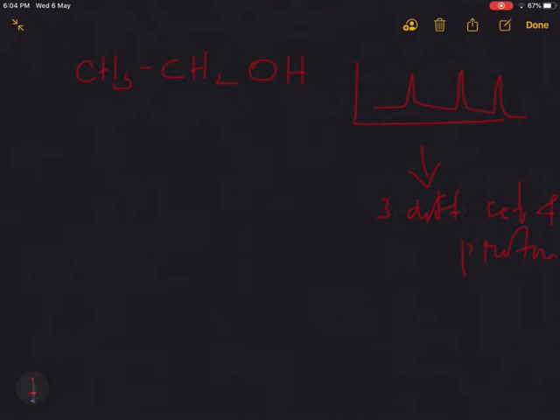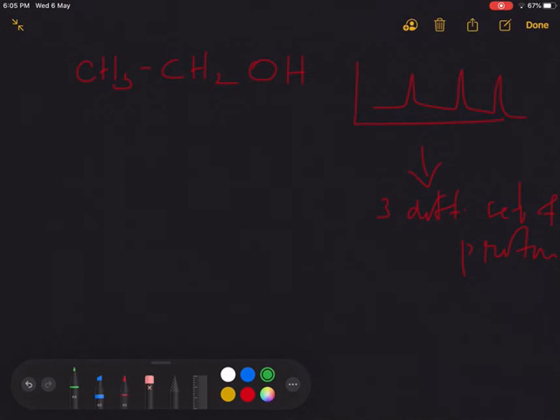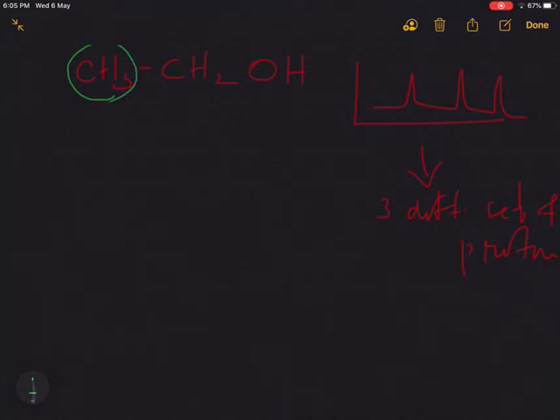How many peaks are there in the NMR spectra of ethanol? Ethanol contains 3 sets of protons. CH3 proton is different from CH2 proton in the NMR spectra. Similarly, these two are different from the OH proton. Only protons give signal in the NMR spectra.